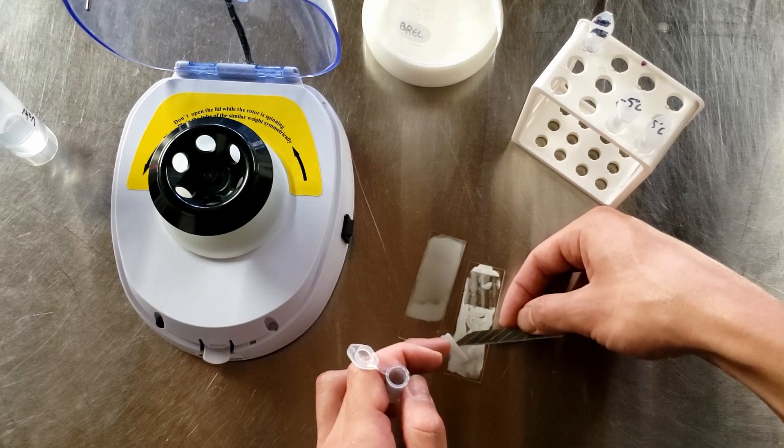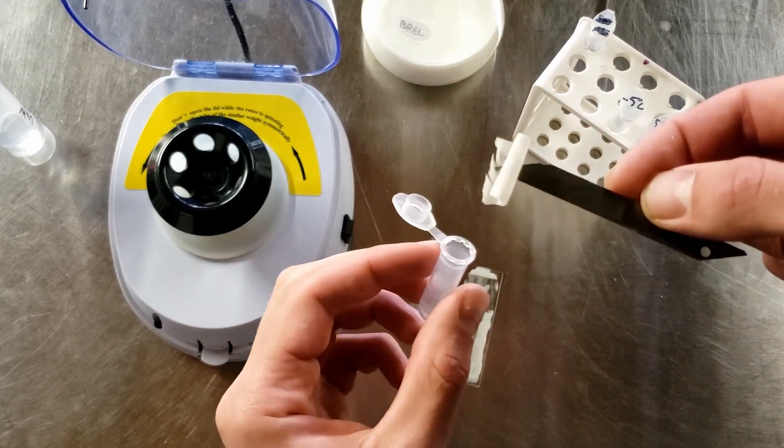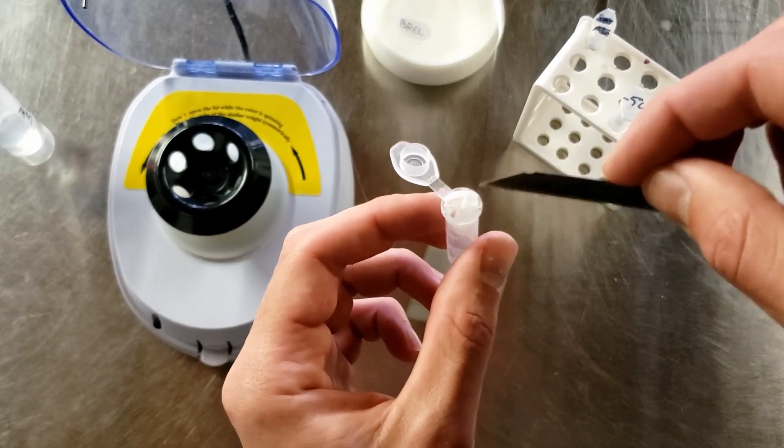This powder is what I used in the experiment to test activity. Although it's not a pure enzyme, it still has measurable activity. Enzyme activity units are a strange thing — any enzyme product, even lactase pills, lists units of enzyme, but every company can essentially invent what a unit means. It usually relates to how much reactant is broken down in a given time with a certain amount of enzyme, but manufacturers tweak variables like substrate concentration, enzyme concentration, and temperature to make their enzyme activity sound larger.